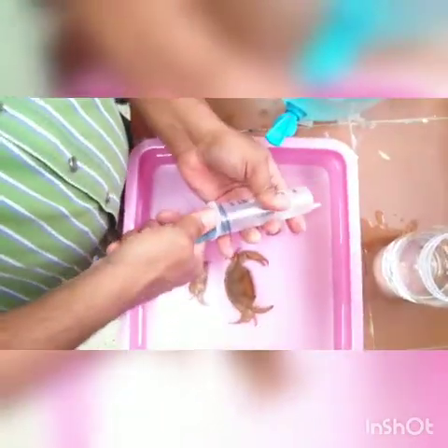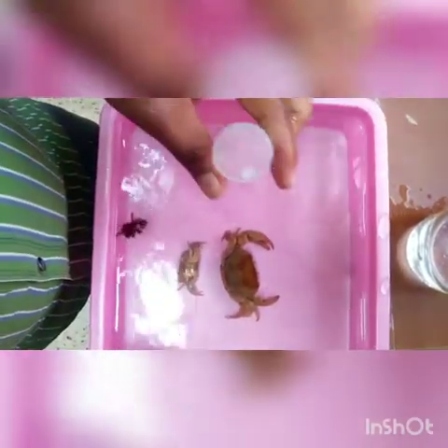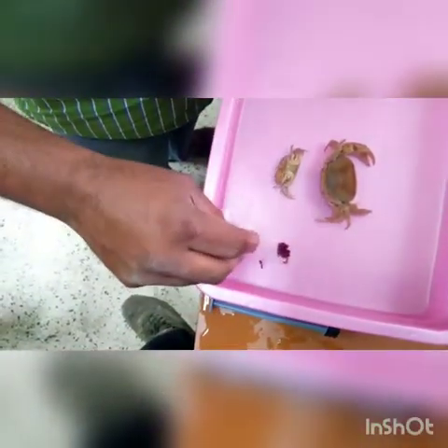Now I think it will not float. If it is still floating, then you can inject again, for small size.